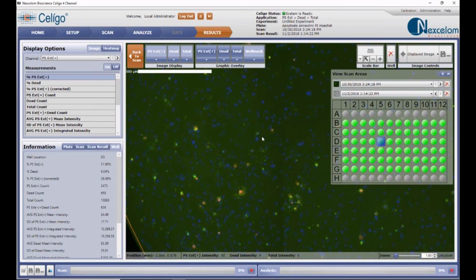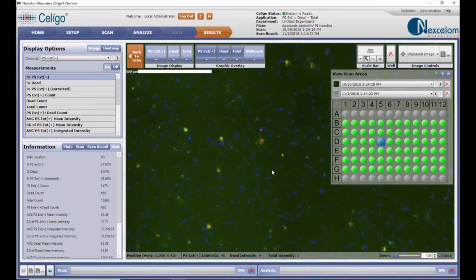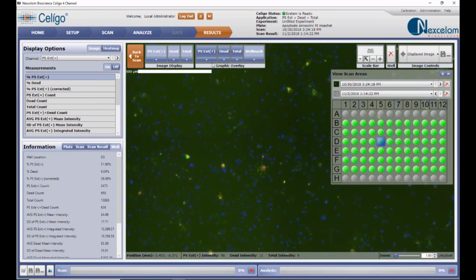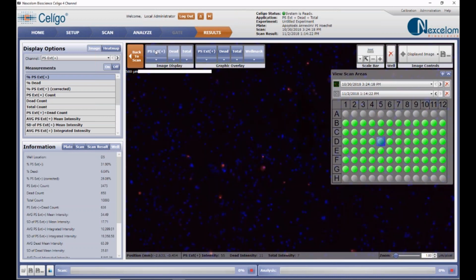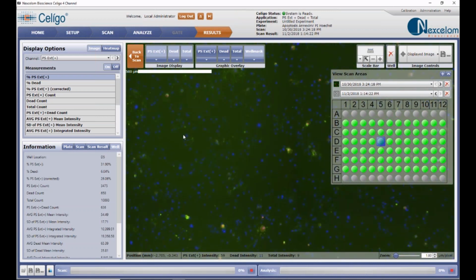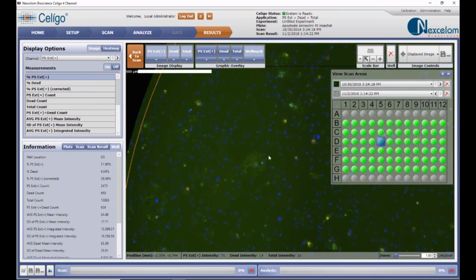Now this is columns 5 and 6. This is after 4 hours of treatment with staurosporine. When I was developing this assay, it was challenging to figure out what is the right cell drug concentration, time, all of that. So this is why I came up with a time treatment over multiple hours to figure out where is the sweet spot where you have a high percentage of PS only versus the dead, double stained population. And this was my workaround to figure that out.